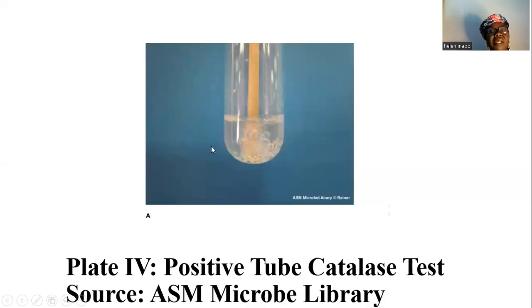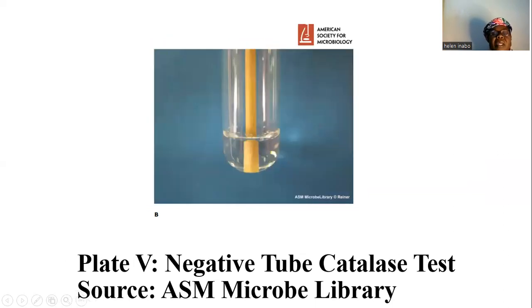Here is a plate showing the positive catalase test, a positive tube catalase test. Here you can see the bubbles that are formed, the immediate effervescence. Here is Plate 5, which shows the negative tube catalase test. There is no evidence of bubble formation or effervescence here.